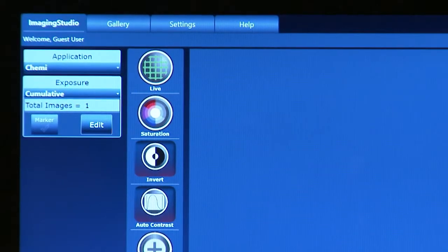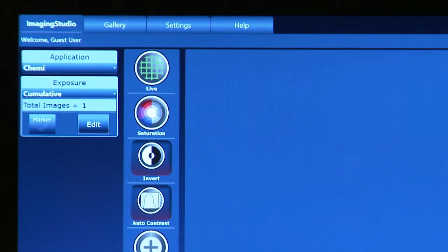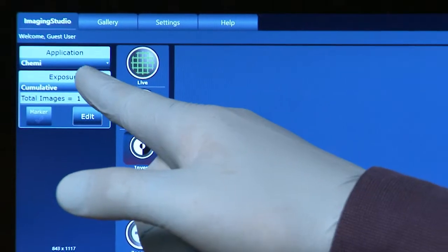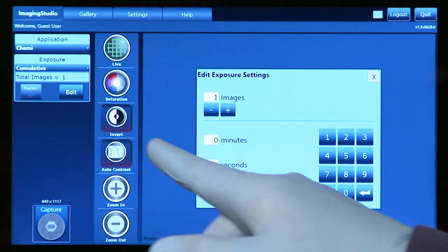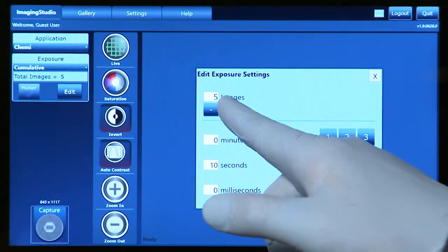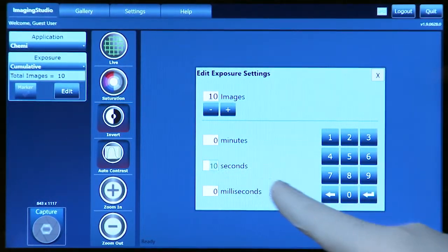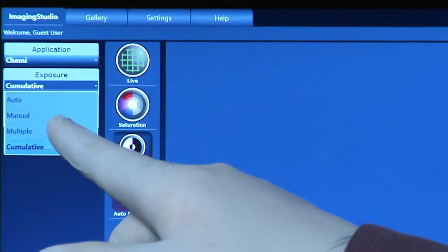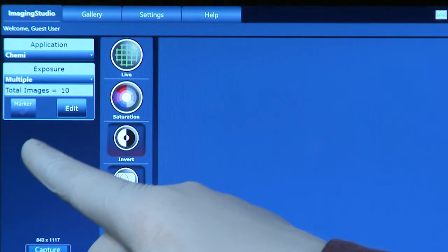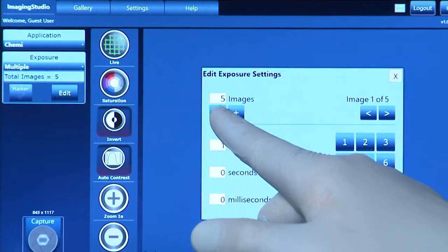For chemiluminescent Westerns, the 2 main exposure methods are cumulative and multiple. Cumulative allows a user to take images at set intervals, where each successive image represents an accumulation of all images to that point. This is a common technique for checking for saturation. Multiple allows a user to take a number of images at preset exposure times, each image starting at time 0.